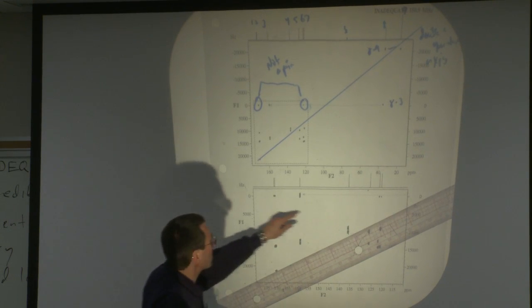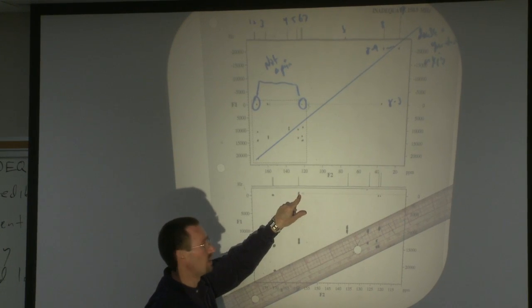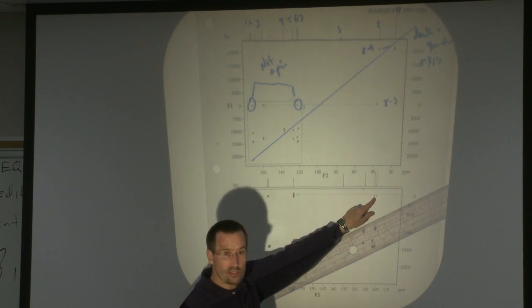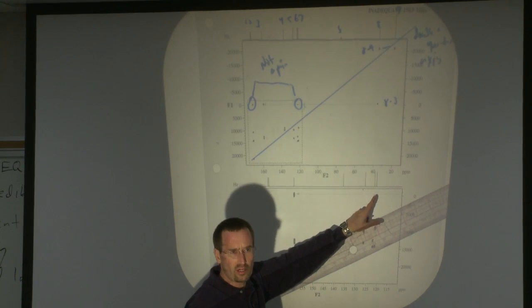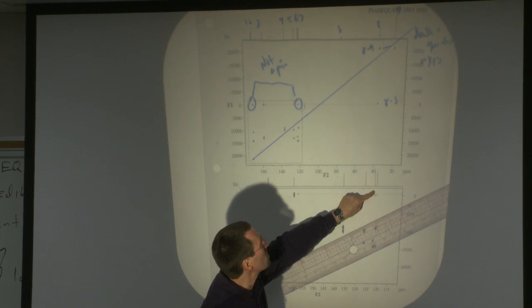So what's interesting here? This is our carbon doublet. You see that's your CC coupling. But here, these are singletons. These are spots. They're not doublets. So whatever it is, it's not J1 CC coupling. We have a spot under here.